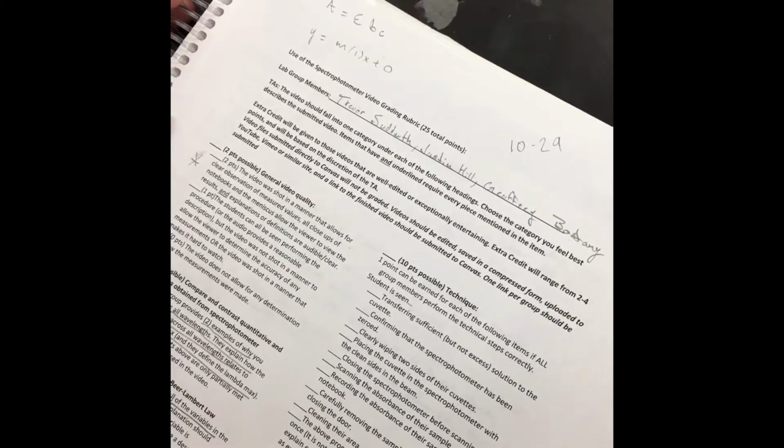So in the Beer-Lambert law, we have this equation up here. A represents the absorbance. The epsilon is going to represent the molar absorptivity, b is going to represent the path length, and c is going to represent the concentration.